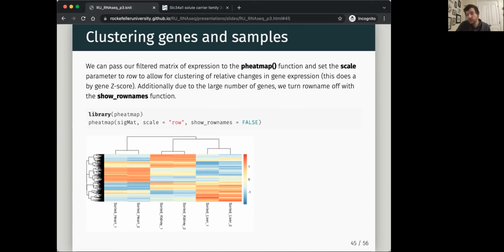Probably. So if you're doing a really thorough analysis, and you're looking at clusters and things like that, quite often people will compare different statistical methodologies and make sure that there's some good rationale and they overlap. And so we kind of touched on that a little bit where we looked at the PCA and then we looked at the results of the DE-seq. But you could then also look at results of clustering and see if all three of them overlap. That would definitely be super, super thorough methodology.